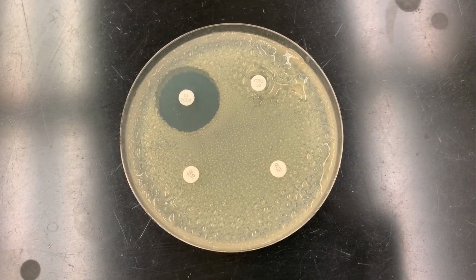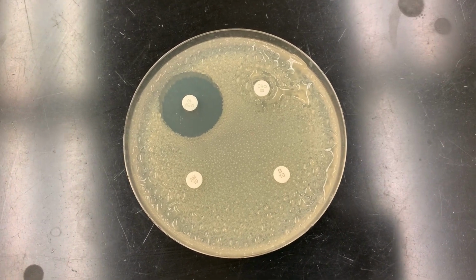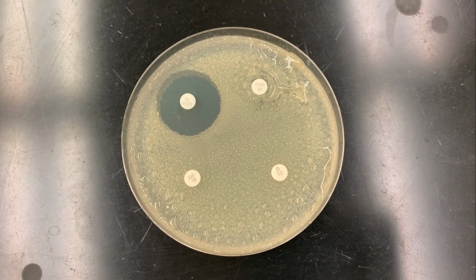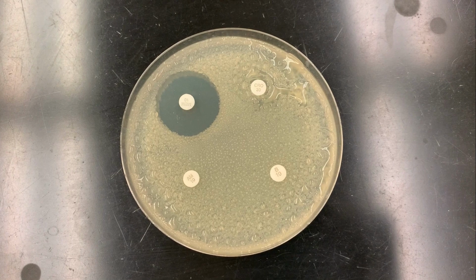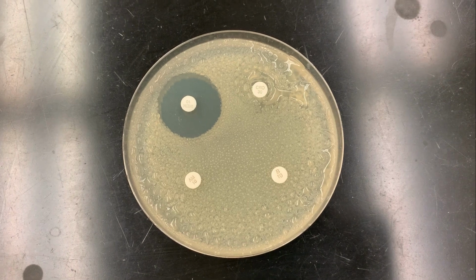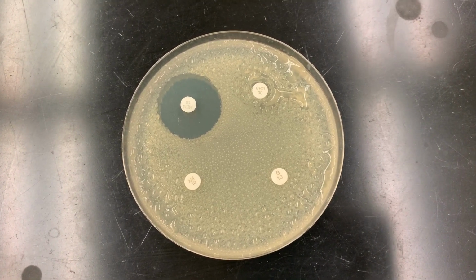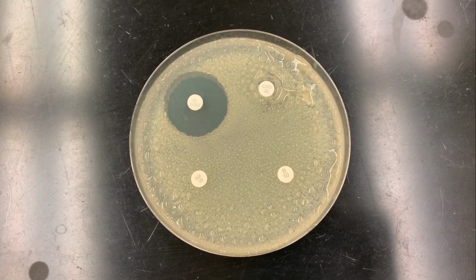However, what we see surrounding meropenem is what we call a zone of inhibition. There is an area around the disc where the bacteria were not able to grow. What this means is that, at least at some level, these bacillus might be sensitive to meropenem. But in order to classify that, we first have to measure that zone of inhibition, and then we will compare it to a standard. And I will include the standard in the video and how to interpret that standard.